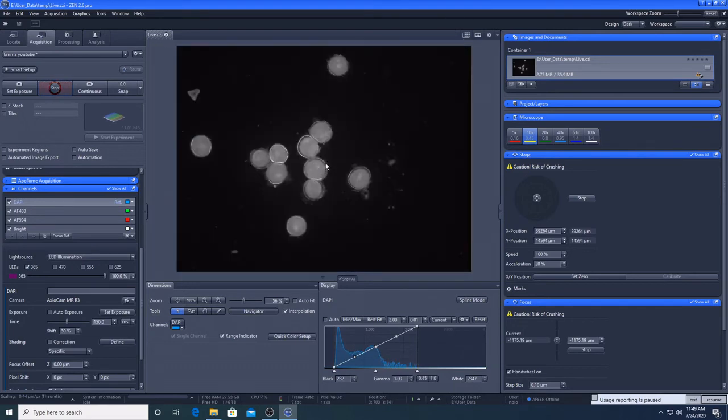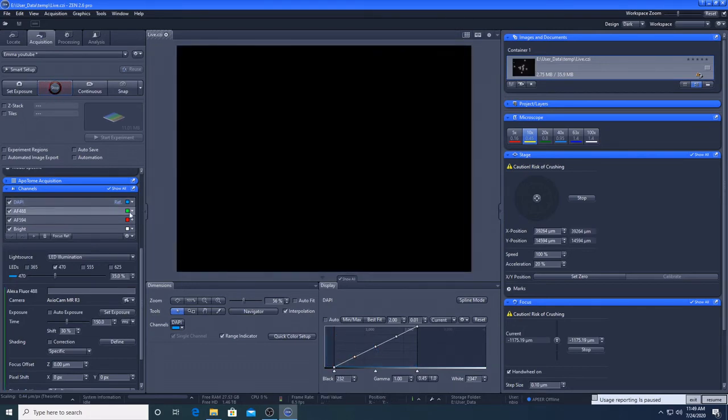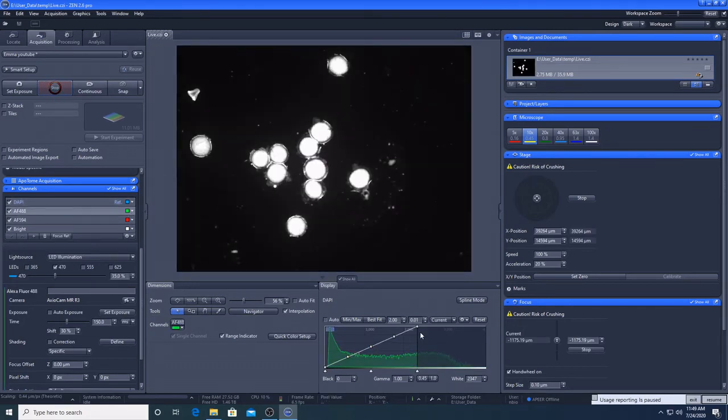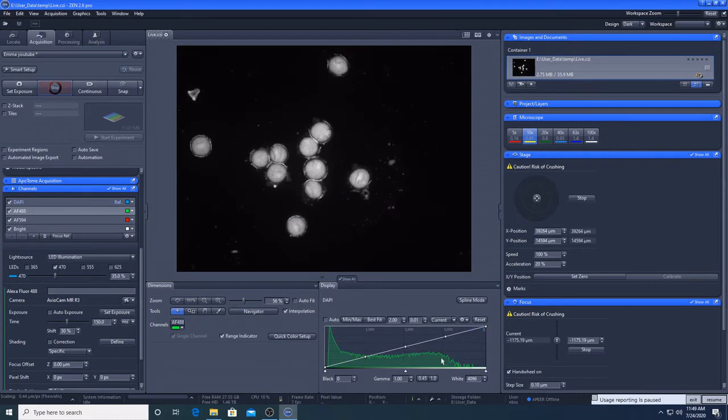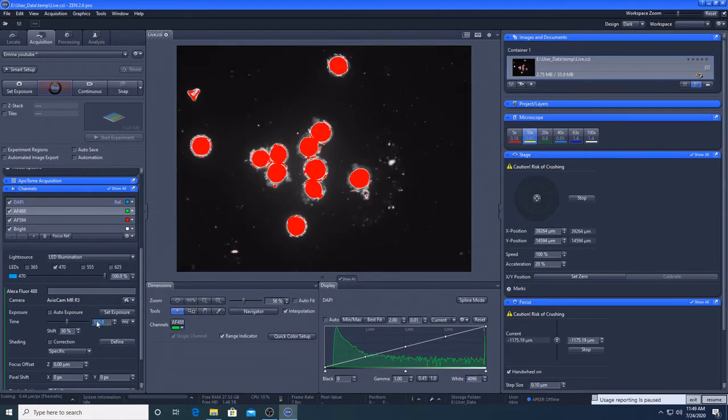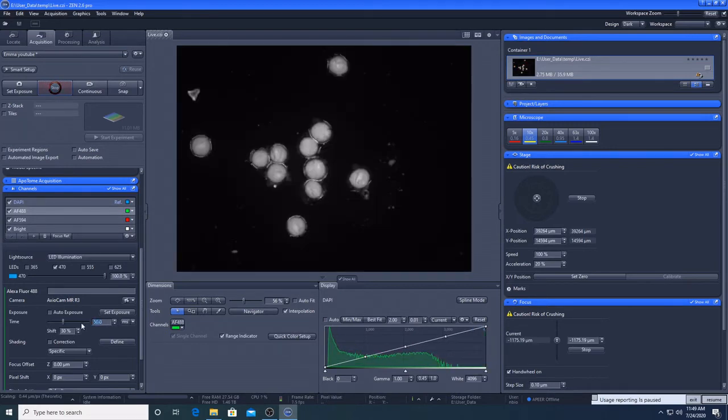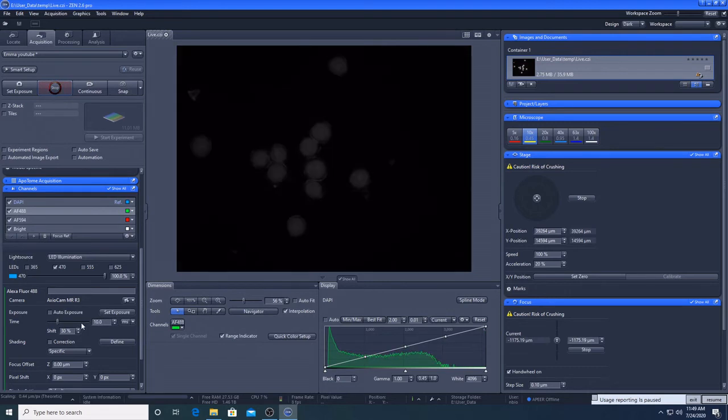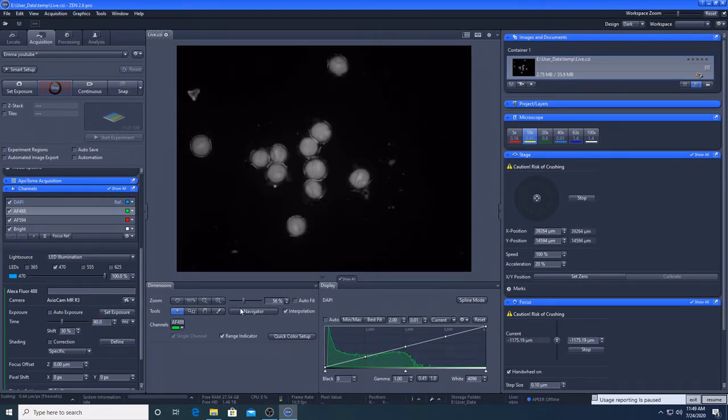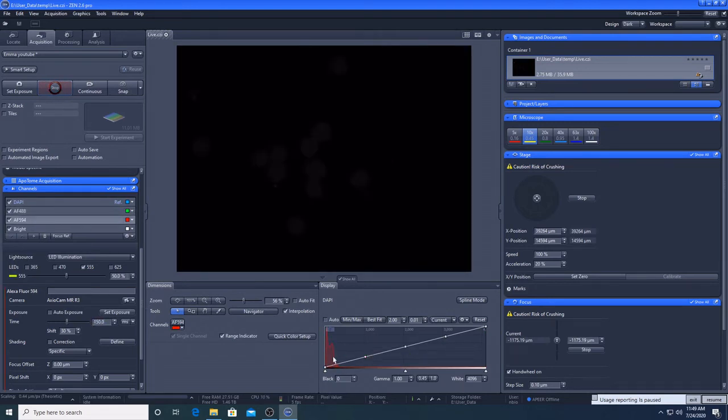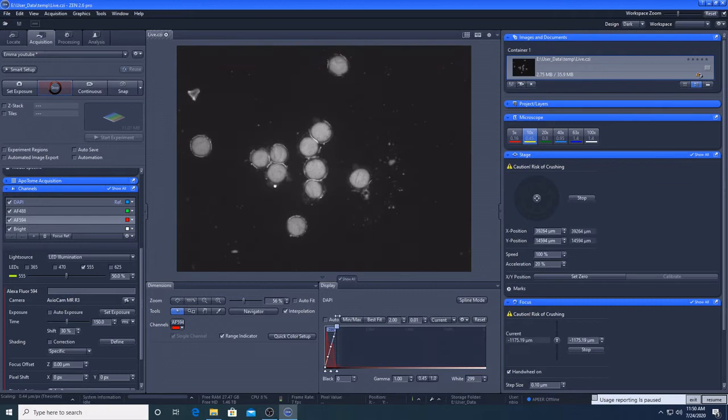We generally say that if your exposure time is longer than 1000ms, then we would recommend trying to optimise your staining methodology if it is feasible. If it is not, and you have to use a long exposure time, and your image is still a bit dull and grainy, it may still be usable.